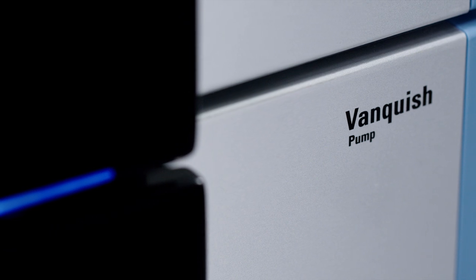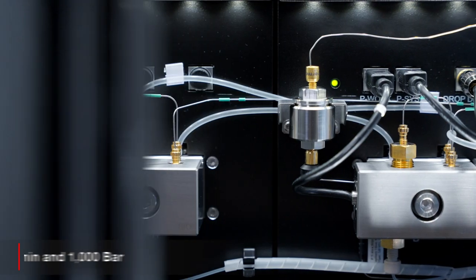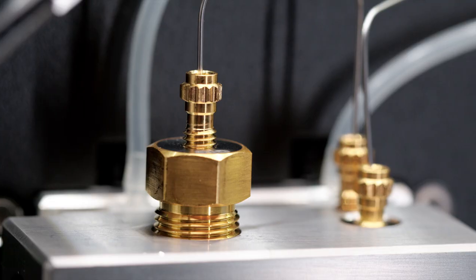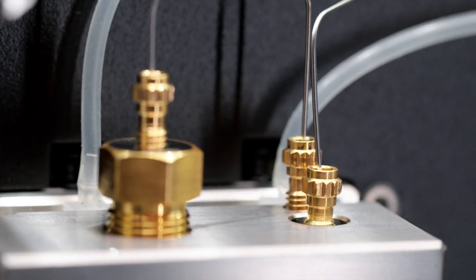VanquishFlex pump technology with SmartFlow delivers superior flow control and retention time precision across a broad range of HPLC and UHPLC applications.